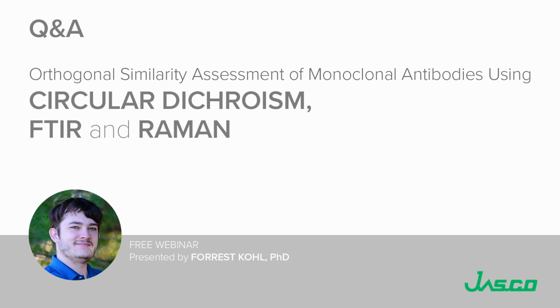So the reference set needs at least 3 samples. What I would recommend is you can operate based on basically statistical principles. If you really want to build a robust data set, around 16 references is probably playing it very safe. A lot of the study here, I think we used 8 samples and references. It's either 8 or 10, and that seems to establish a pretty good interval.